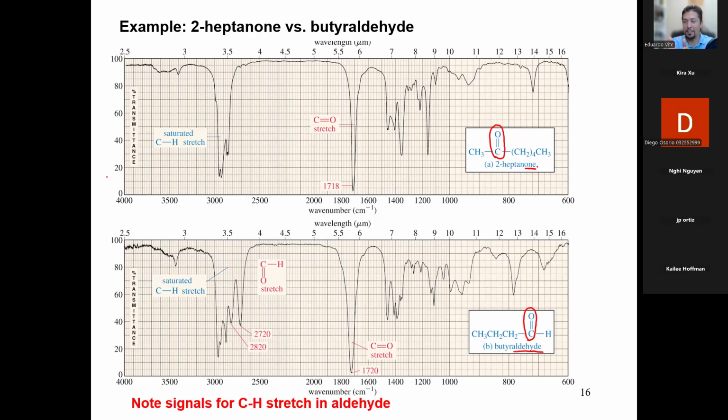You see, this is just carbon double bond oxygen RR. That's a ketone. The bottom is carbon double bond oxygen hydrogen. That, by definition, is an aldehyde. And so let's compare the two spectra. I'm going to use the color blue for the carbonyl.